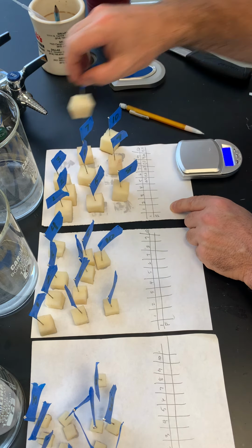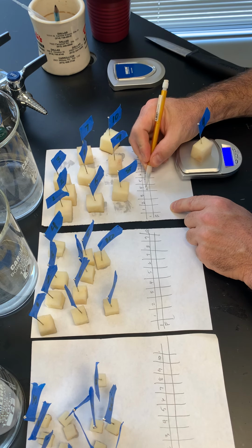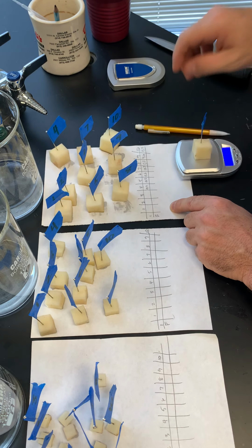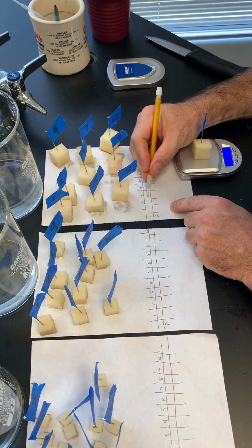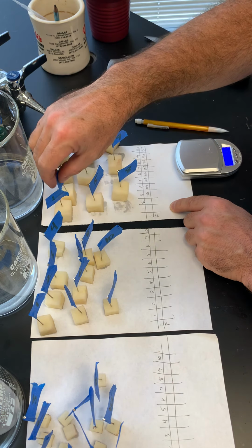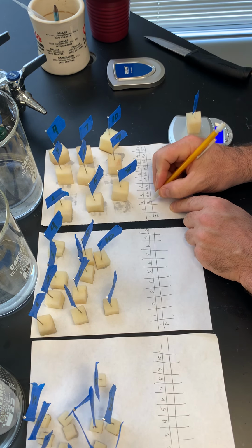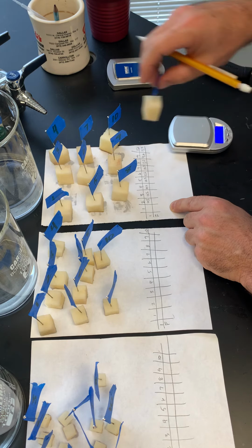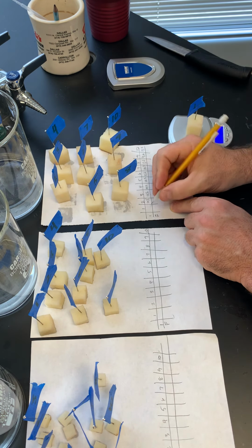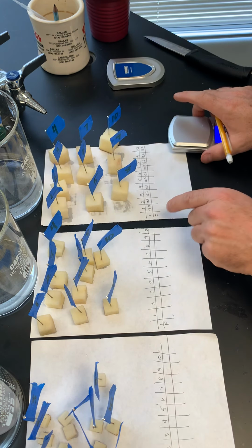I'm going to go 4. 10.9, 3, 10.5. 2 is 10.5 as well, yay. I was really accurate on this one. This one's a little bigger, it looks like. 12.8. So all these are ready, and then I'll go to my next group, my 1.5.